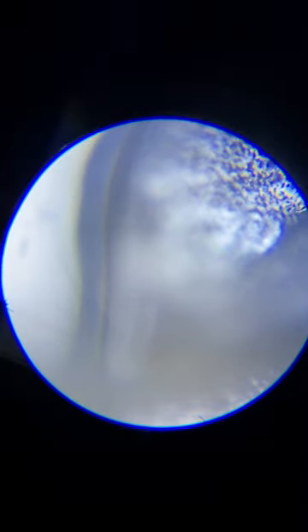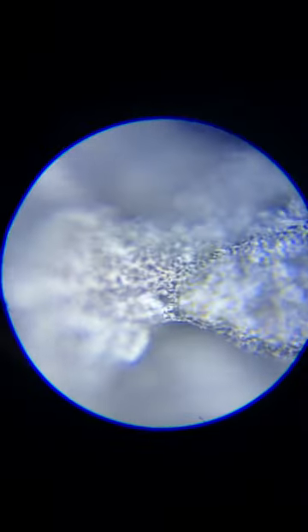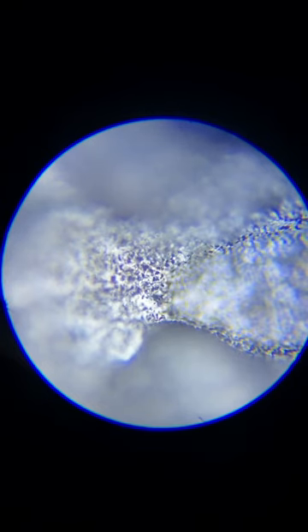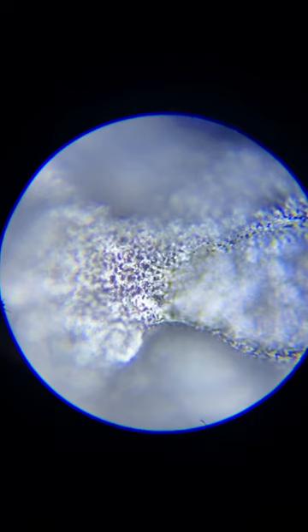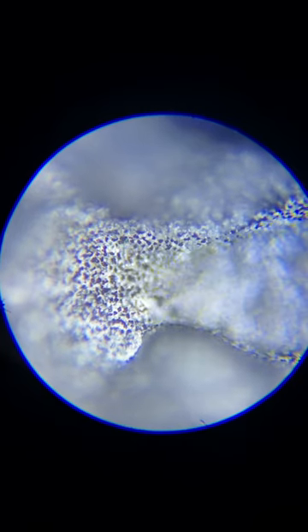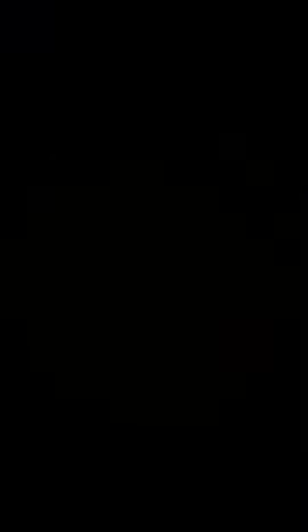100x should allow you to see the spores a little better. I don't want to go too close where my objective will hit the cover slip, so we're back at 40x.